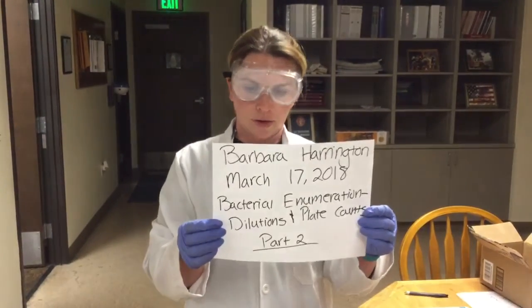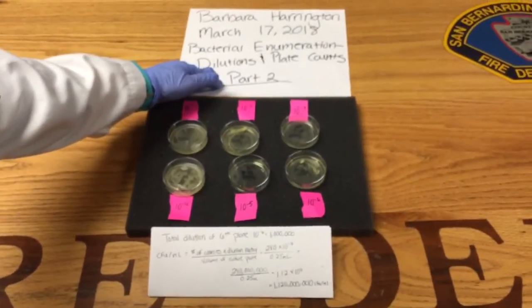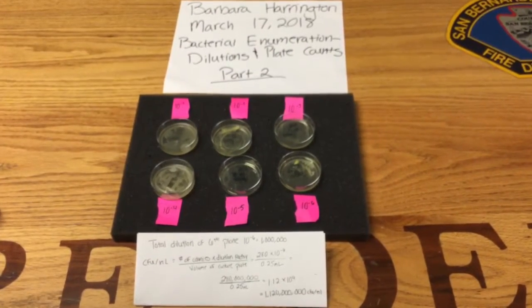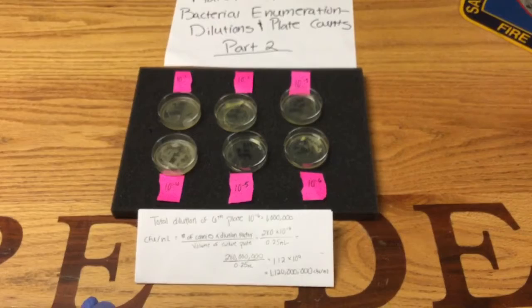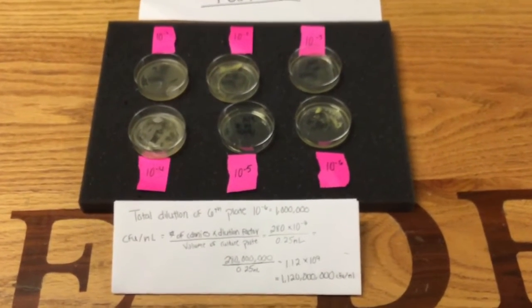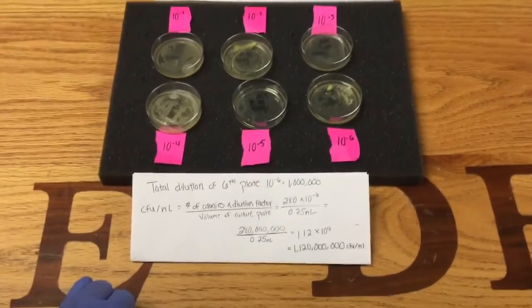This is part 2 of our lab with our dilutions and plate counts. So, about 48 hours ago, we had inoculated these agar plates with the S. cerevisiae bacteria that we grew from the yeast packet in our lab pack that we got sent to us in the mail.